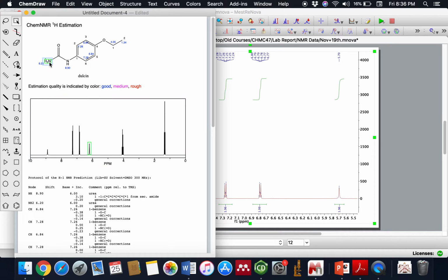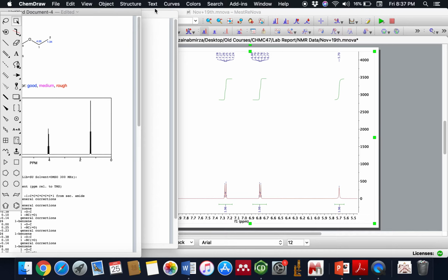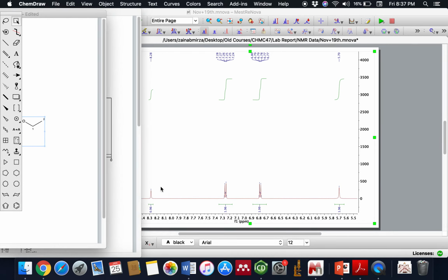So that makes sense. The next one here is coming from those 2 protons, the benzene protons or the phenyl protons, and same here. So everything makes sense. All the integrals are matching, and this last one here should have an integration of 1 because it's only 1 NH proton, and let's just see. Yeah, that's the case. So 0.96 is very close to 1.